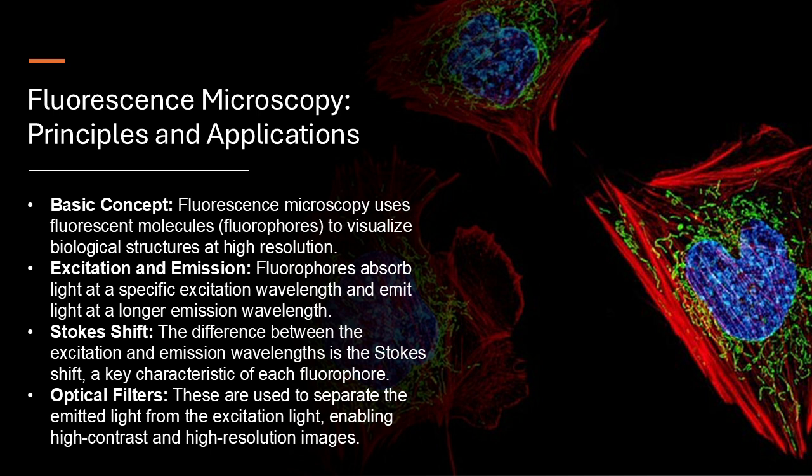Precisely. Confocal microscopy uses pinholes to create what are called optical sections. These thin slices give us much sharper images and allow us to build 3D models of cells. So we can create a 3D map of the cell's interior. Absolutely. That's amazing. And then there's multi-photon microscopy.